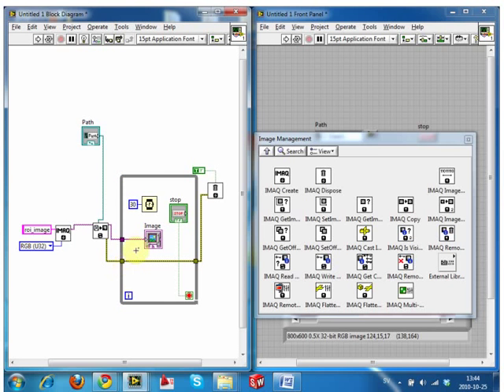No. So this is just an indicator. Okay, so I see. Yeah, it's just a visual indicator. I mean, we could tell it to display the numbers, and it would show a big array. Okay, I see. So the file is being written to an image here, and then here it's just displaying it. There's no reading of the file. Okay, I understand. Then it makes sense that you wire it up to the other one.